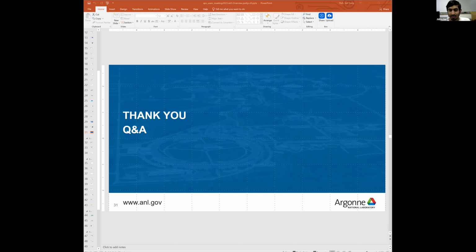Thanks. Hey, June, thanks. Great talk. I have a few questions, but I'm going to go with one first. You mentioned a 1 micron resolution on tomography, right? I was wondering, what is the limiting factor there? The main thing is the pixel size on the detectors that we have. Peter can probably give you a lengthier explanation as to where that comes from, but yes, about 1 micron, from the detector pixel size. Okay, thanks.